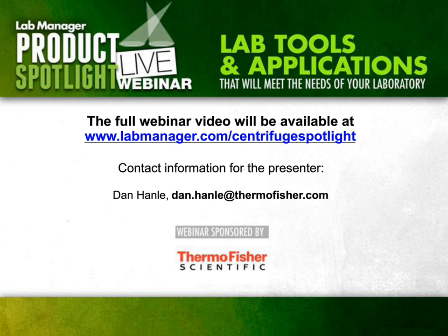Well, I guess the general thing is you want to make sure you know what's going to happen, and maybe service people are around all the time. Maybe if you know them, talk to them and make sure they're available to you. And if it's a top-end centrifuge like an Ultra or even a Super Speed, you might want to put preventive maintenance on it. But let's start down in the benchtop for a second. I talked about greasing the O-rings. The thing you're going to want to do in a benchtop, and any swinging bucket rotor for that matter, is lubricate the trunnions.